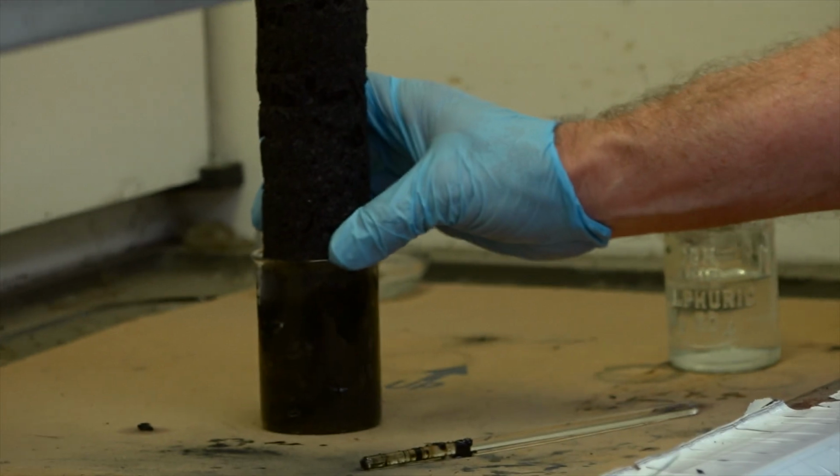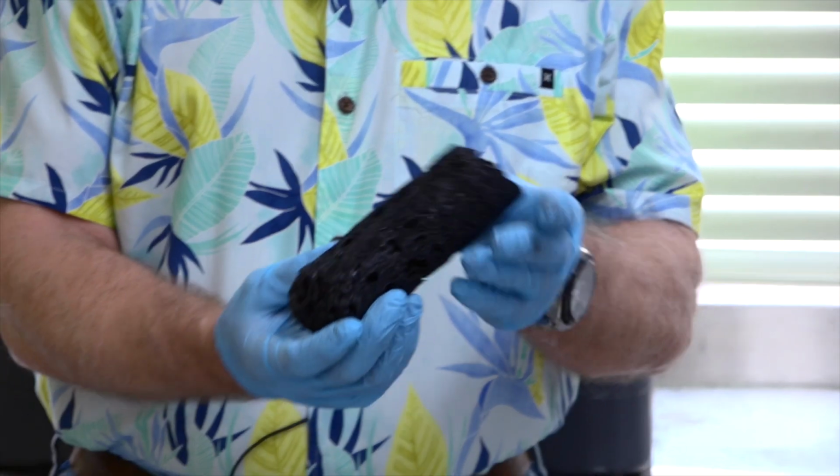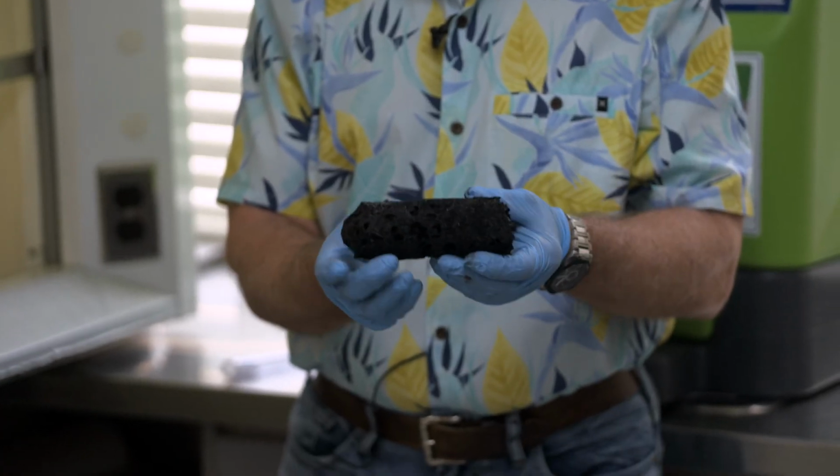This is just carbon. Oh my God. So it's black, it's carbon, and the bubbles are water vapor.